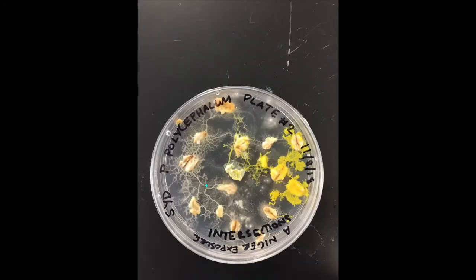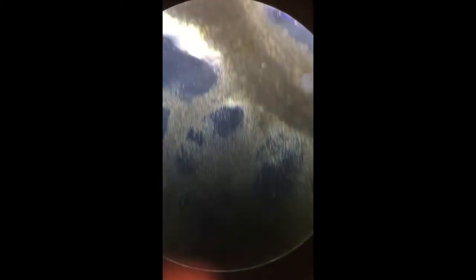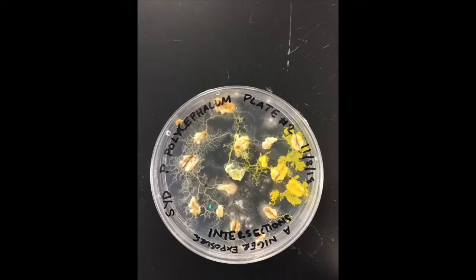Hour 72, things take a dramatic change and all the slime mold has now grown on the right side of the plate instead of the left. You can see really dark slime trails everywhere where the Aniger was. I'm led to believe that the slime trails are so dark because it was transporting black mold spores — it looks darker than normal, more opaque than normal.